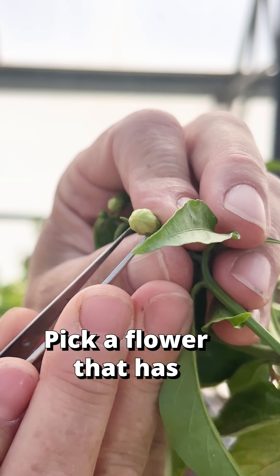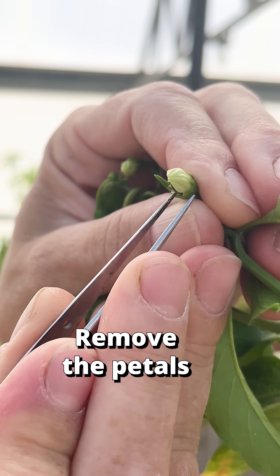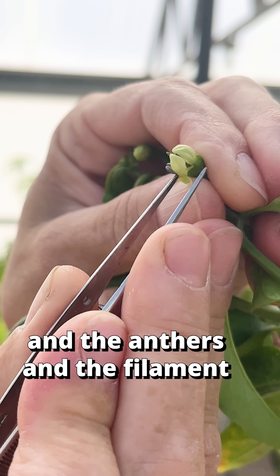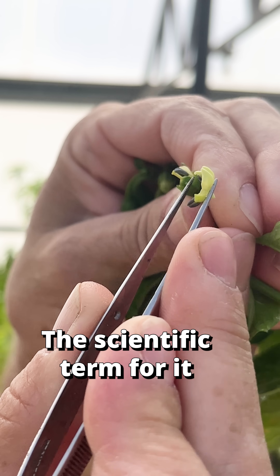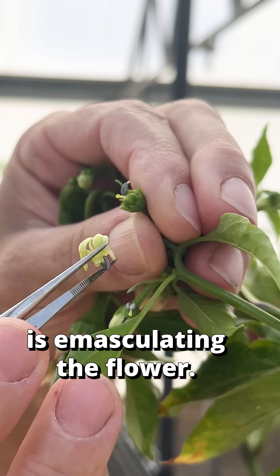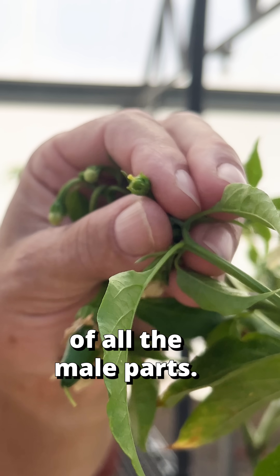Pick a flower that has not opened yet, remove the petals and the anthers and the filaments, so all that's left is the stigma and the ovary here. This is emasculating the flower. This is the female plant, the mother plant, so you want to get rid of all the male parts.